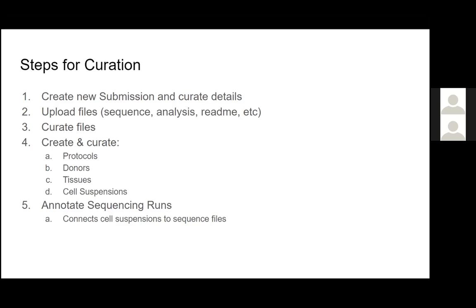So for now, and for the purposes of this workshop, we're going to exclude those sorts of imaging files from the process. After we upload the files, we curate them, so just basic information about the files.